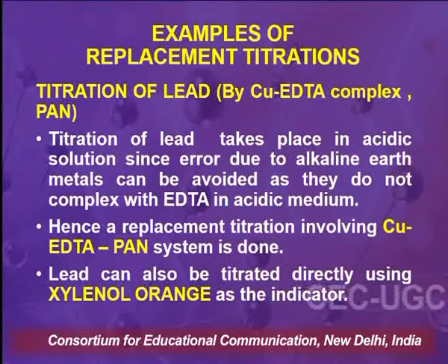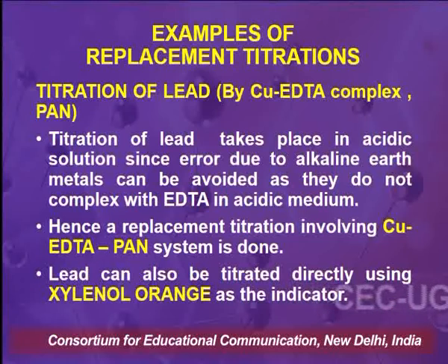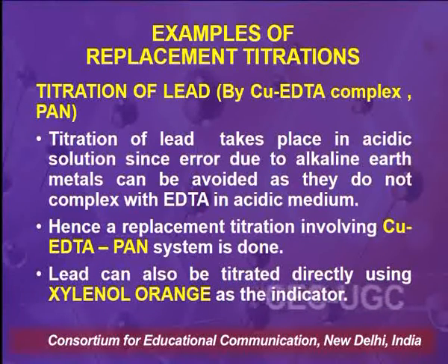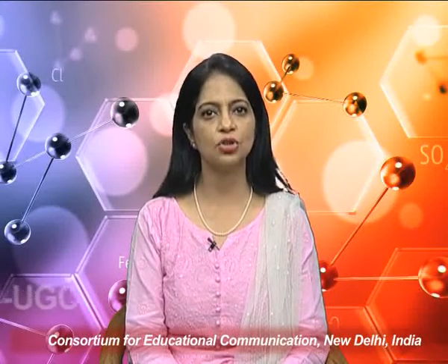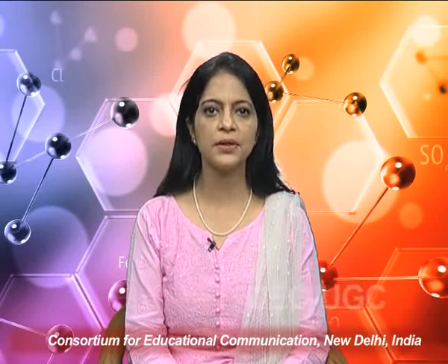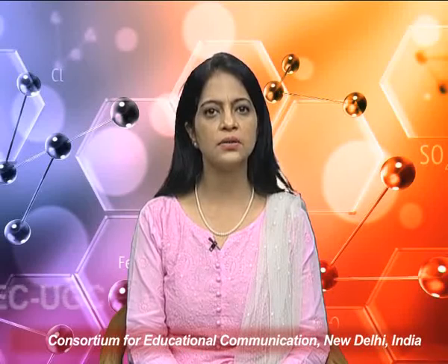Next is the titration of lead, another example of a replacement titration, by copper EDTA complex using PAN as the indicator. The titration of lead takes place in acidic solution, since error due to alkaline earth metals can be avoided as they do not complex with EDTA in acidic medium. And if an acidic medium is created, then the titration of lead takes place smoothly. Hence, a replacement titration involving the copper EDTA PAN system is done.